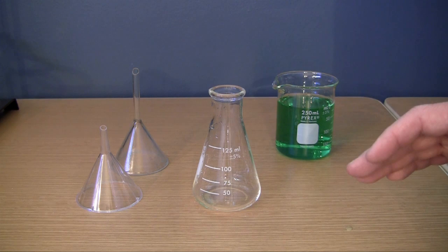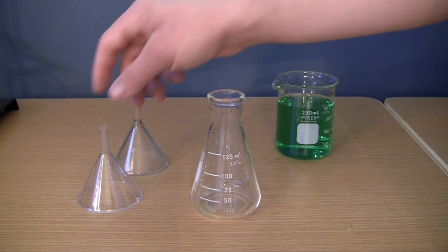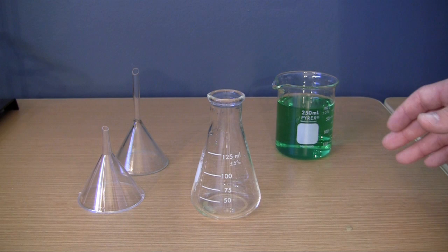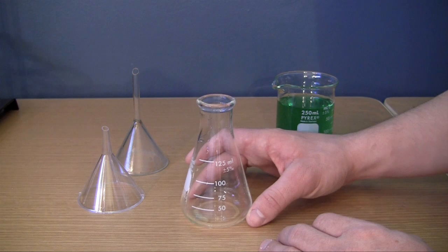Now I don't want to explain in detail how to use a funnel because first of all it's incredibly easy and second of all if you don't know how to use a funnel you probably shouldn't even be in a chemistry lab. But what I would like to do is talk to you guys about a technique and I want to mention this because it bothers me a lot. A lot of people do this and well it's just incorrect.